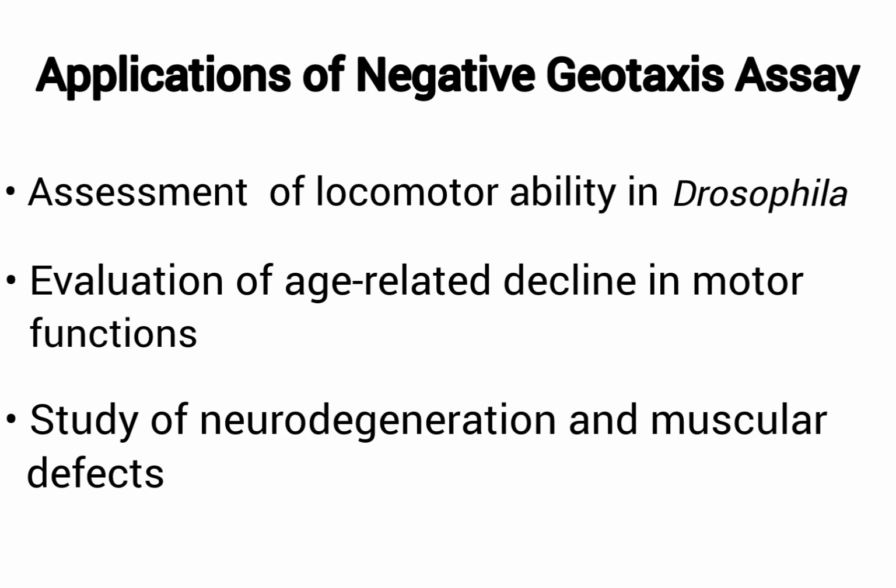Some of the applications of negative geotaxis assay are assessment of locomotor ability in Drosophila, to evaluate age-related decline in motor function and also to study neurodegenerative disease models and muscular defects.